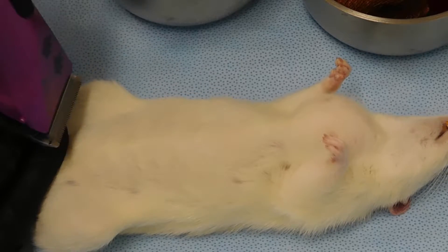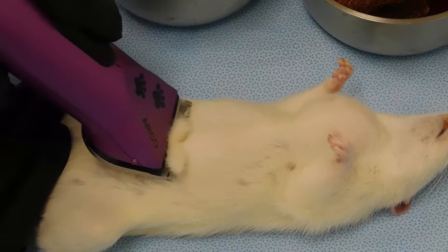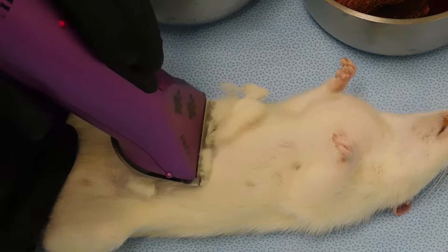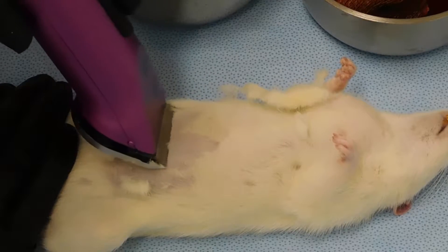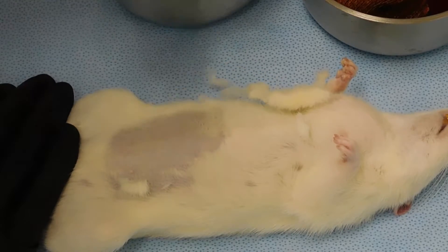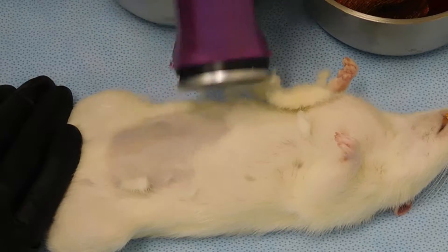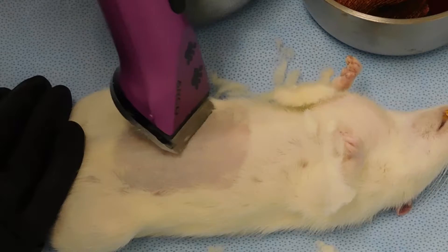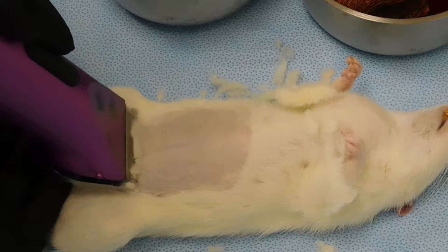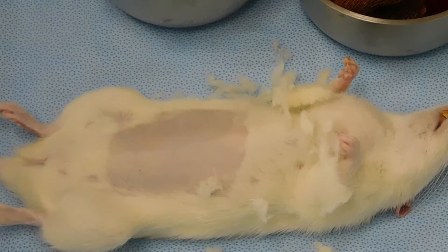Once your animal is appropriately anesthetized, don a pair of exam gloves to clip the area of your anticipated incision. Clip this area using a number 40 clipper blade. This area should be approximately three times the size of the actual incision. In some cases, the size of the animal may limit this.